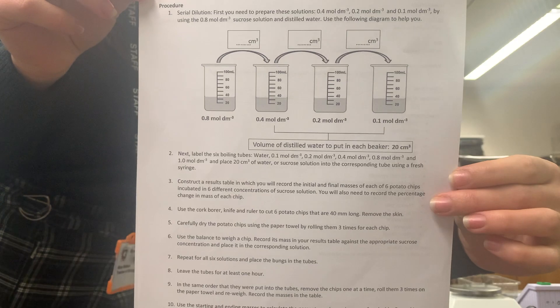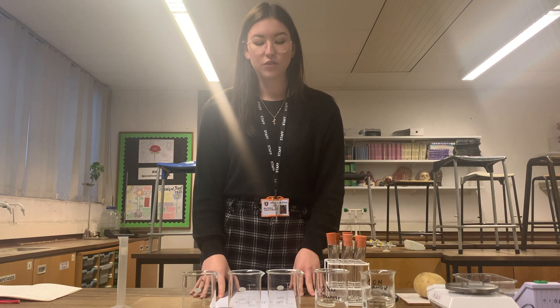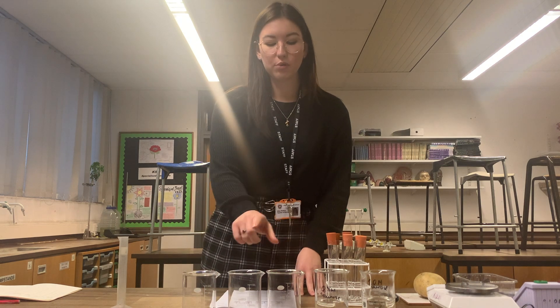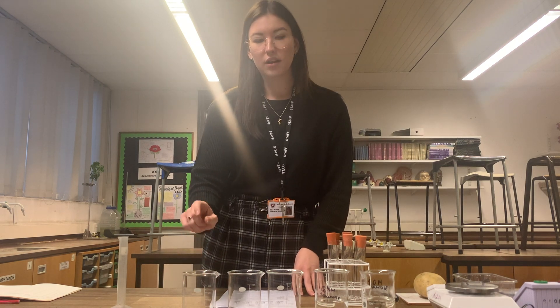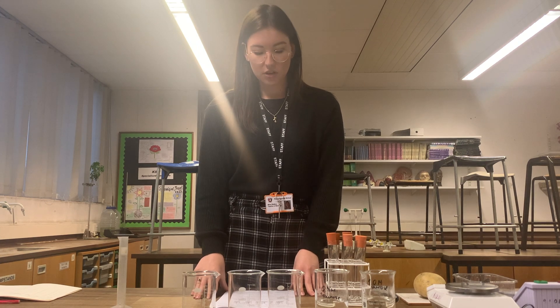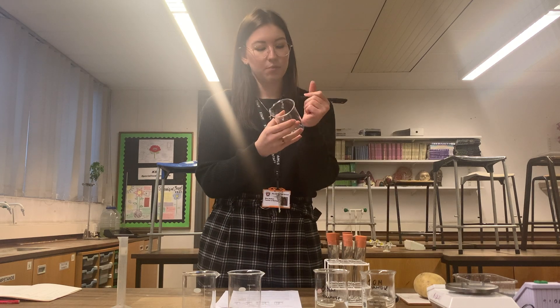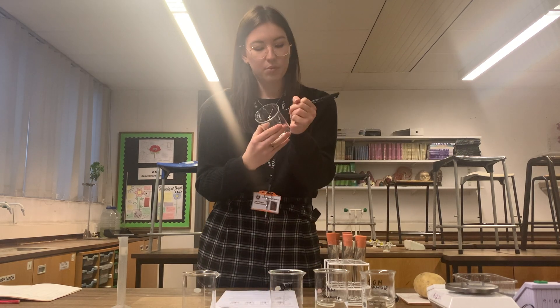This is the diagram. The total volume of sucrose solution we're going to want for our 0.4, 0.2, and 0.1 mole per decimetre cubed sucrose solutions is 40 centimetres cubed. I need to label my beakers before I begin, so we have 0.4 and 0.2.